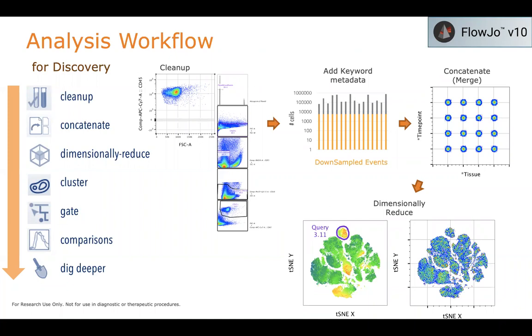Okay, same thing with age of the mice, right? You might have young mice, you might have juvenile mice, and then you'll have adult mice or elderly mice, right? So you may want to add that information as well, even though it may not be the primary thing that you're testing. Okay, so addition of metadata, super important.